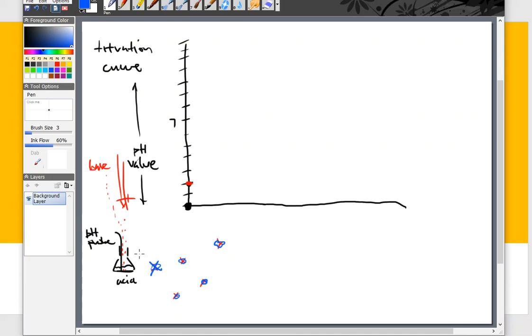So there's a lot of acid in that flask, and we're adding drops of base. So over time, what do you think is going to happen? I'm adding base little bit by little bit. I'm neutralizing the acid that is in that flask. So over time, as I add a certain number of milliliters or volume of titrant to that sample flask, my pH is going to start to slowly go up and up and up and up, right? I'm just going to start to see an increase in the pH value.